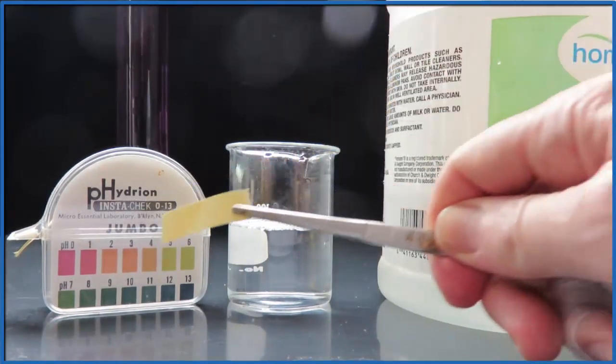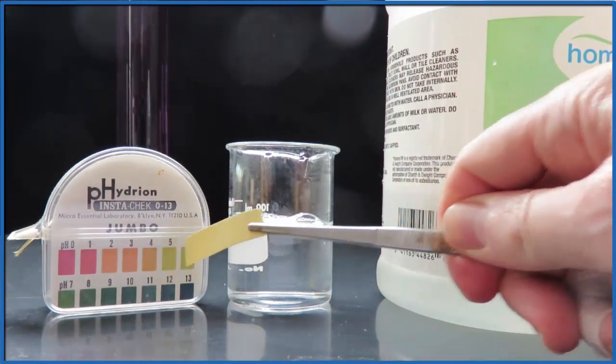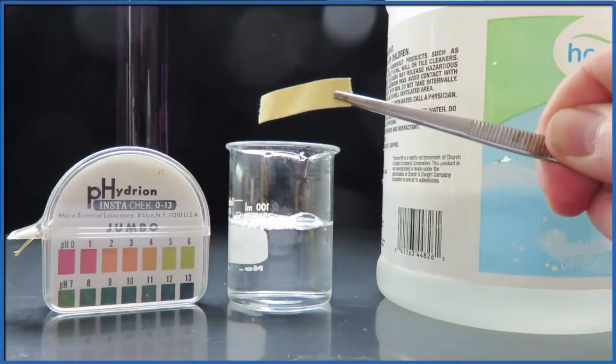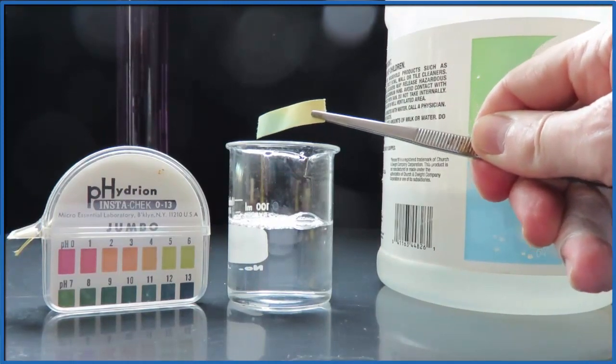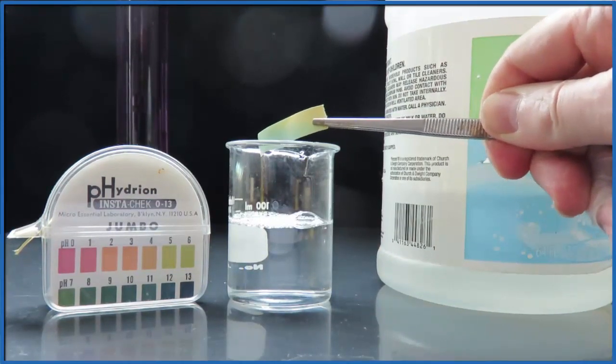We can even see this a little bit better by taking a piece of pH paper and holding it over the beaker where that ammonia gas is coming up, and the pH paper starts turning green immediately. So it's changing in response to that ammonia gas.